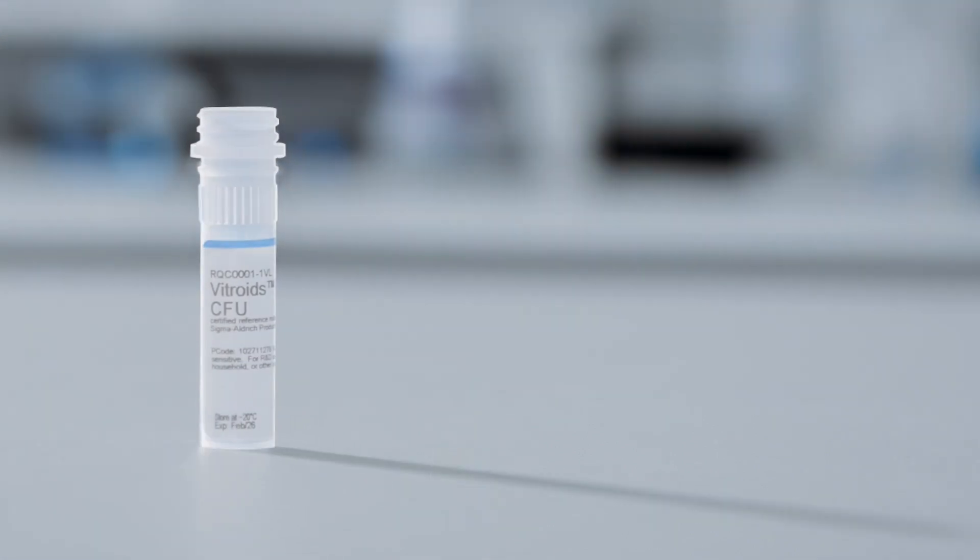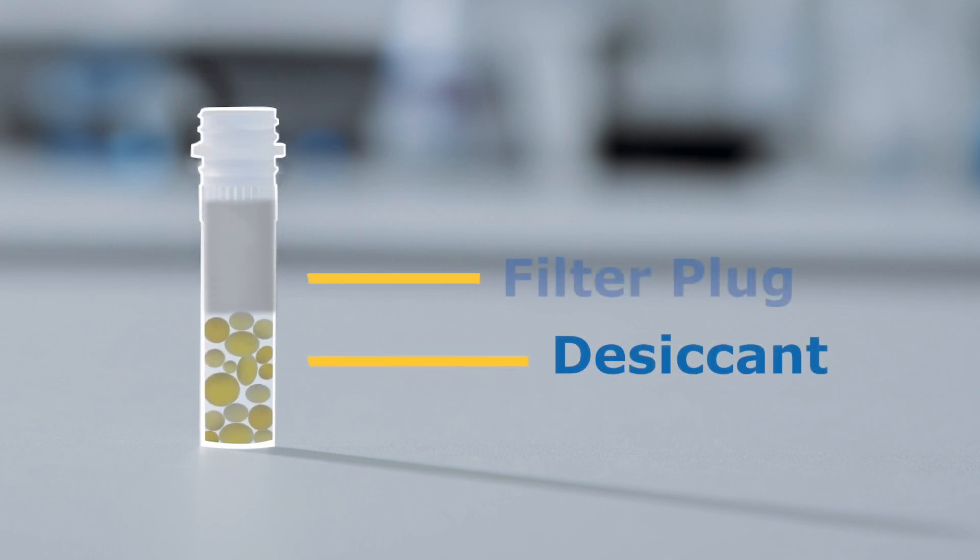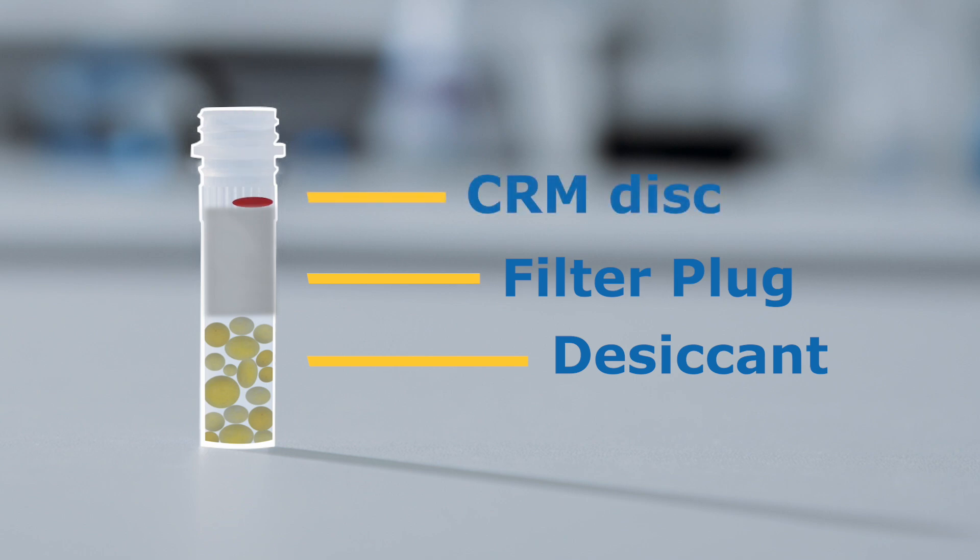Each disc comes in a vial in which it lies on a white filter plug. At the bottom of the vial there is desiccant, which should be yellow. If the desiccant has turned white, do not use the disc.